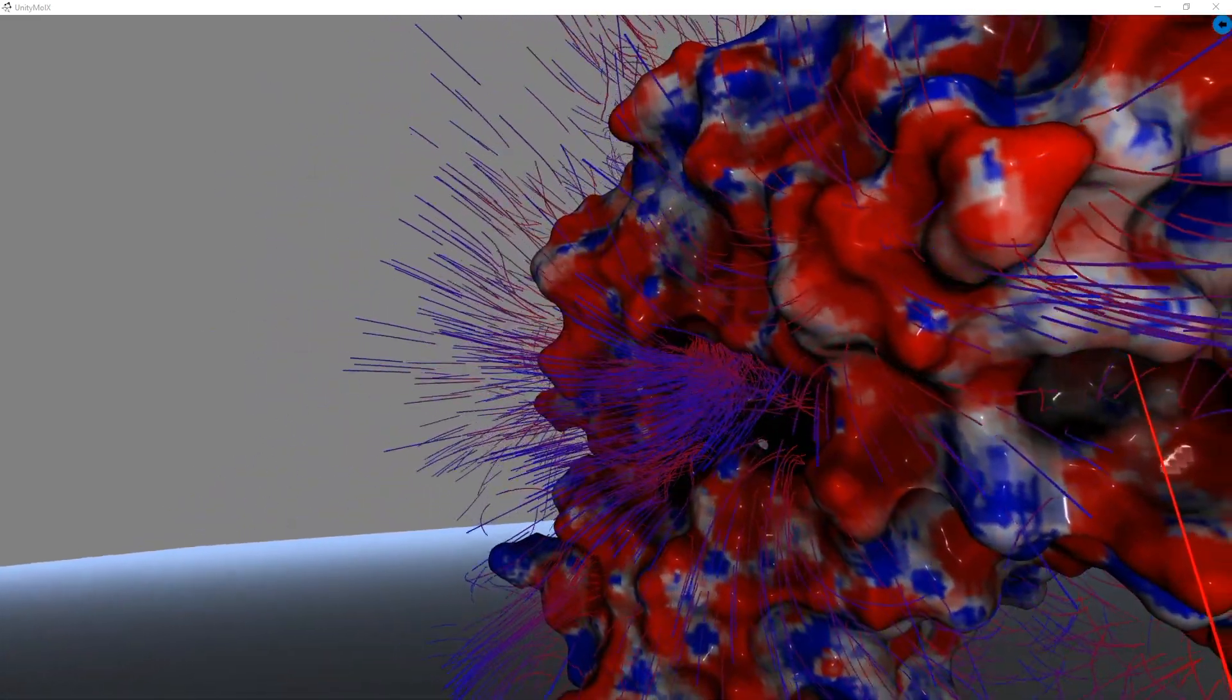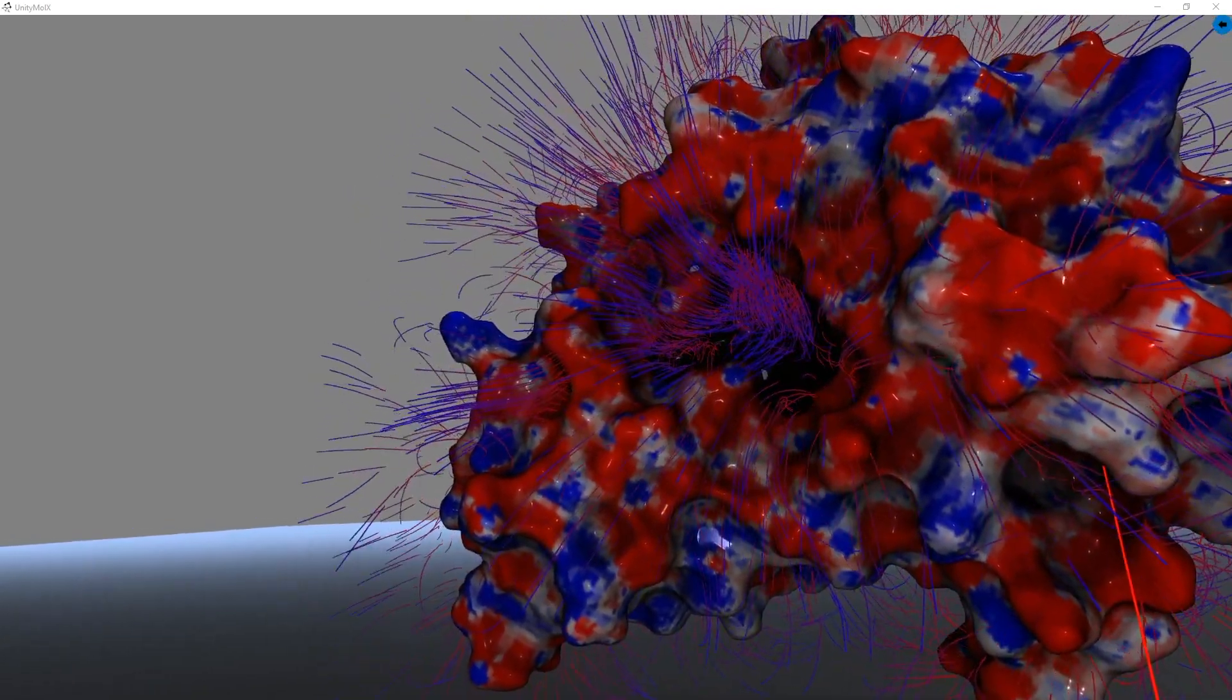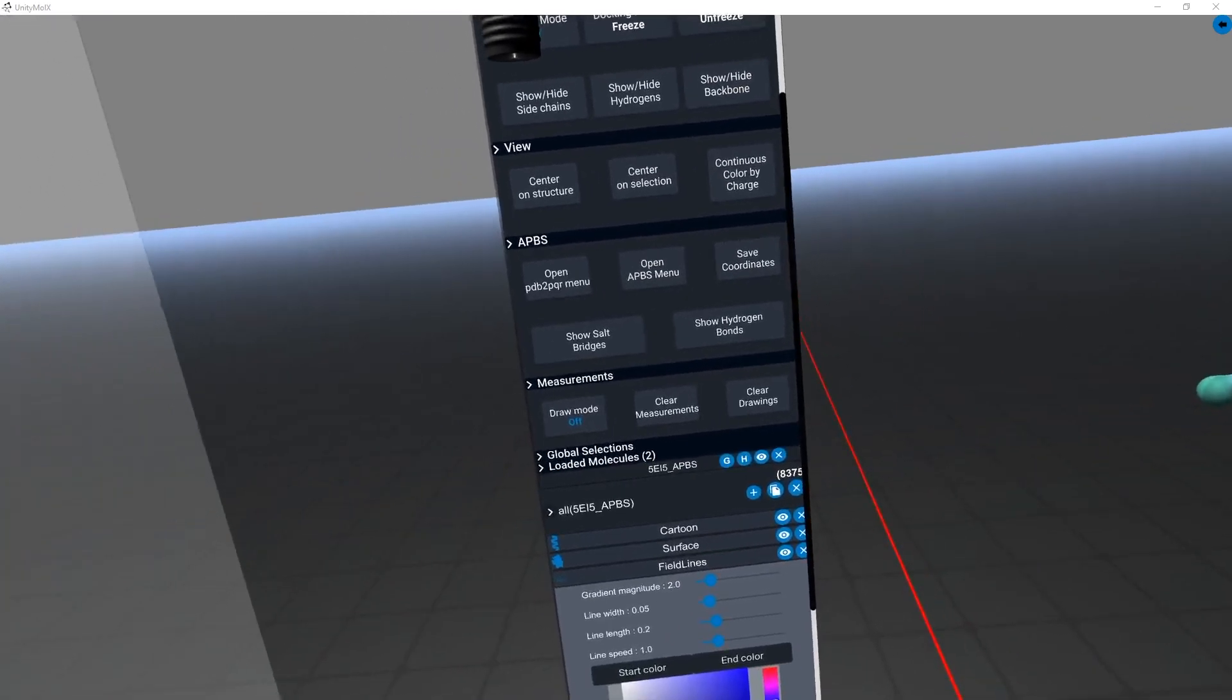As we then rotate the structure, we can more clearly see the electrostatic gradient pouring from the end of the catalytic gorge out into the solvent.